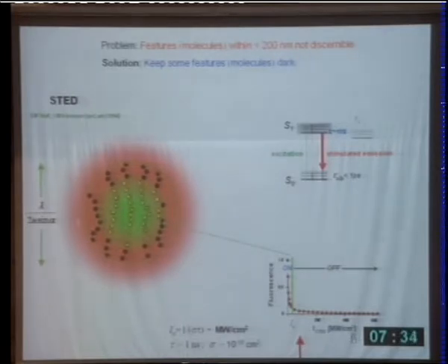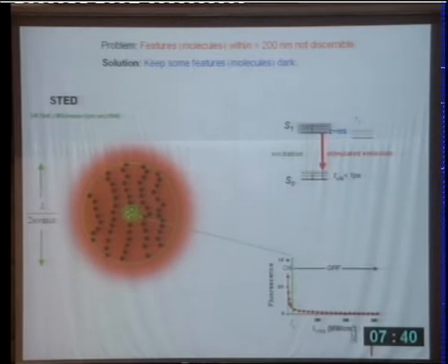And so what we have to do in order to shut off also those molecules, it's very obvious. We have to increase the intensity of the donut such that the threshold moves in. And now also these molecules are turned off, and we get signal only from here. And this is what we want. Now we can separate signal from this strand from signal from the rest.